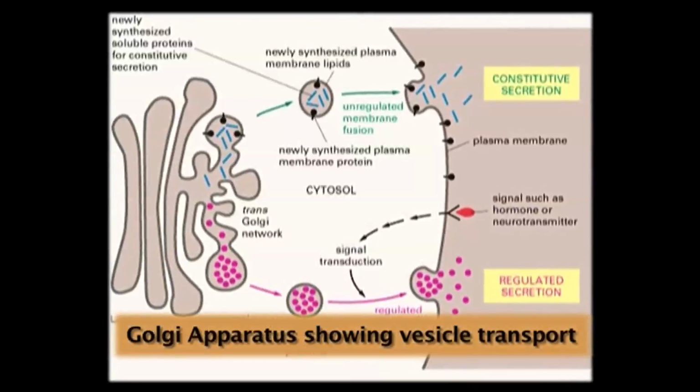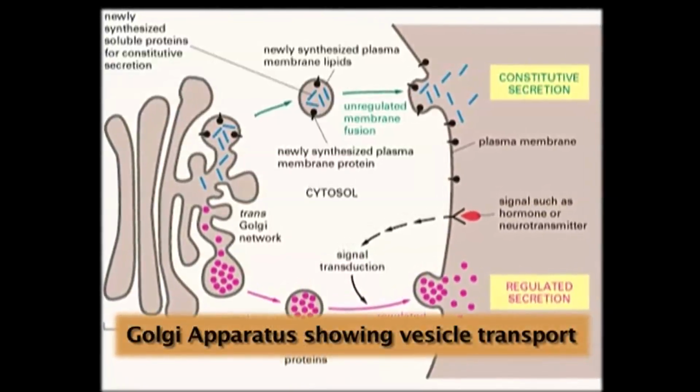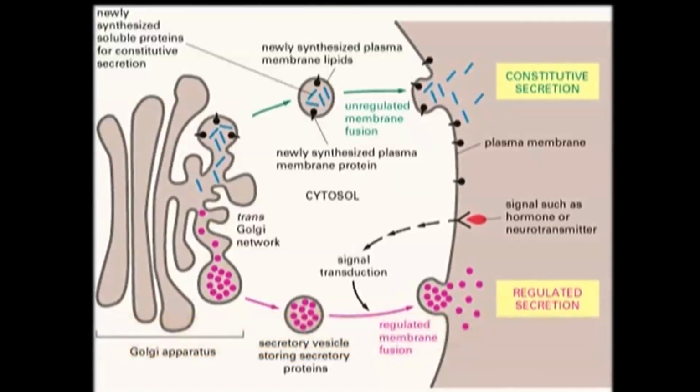Now, if one fluorophore is in a particular part of the cell where the pH is very high, the lifetime will have a particular value. The same fluorophore which is present in another section of the cell, let's say the fluorophore has gone into some vesicle or has traveled into the Golgi apparatus or even some secretory vesicles, then the pH value is not the same.